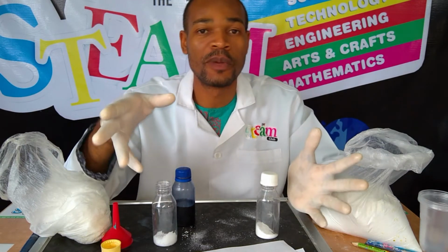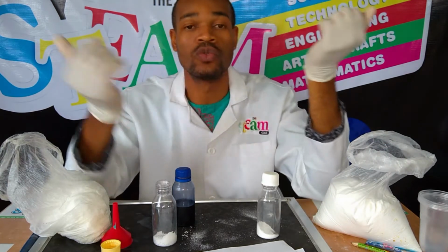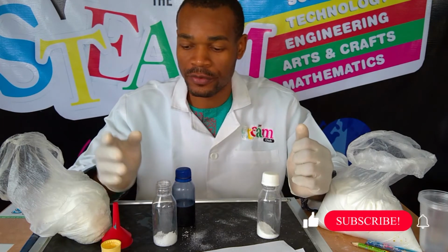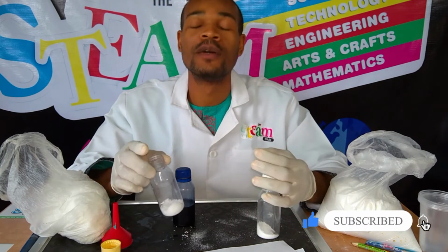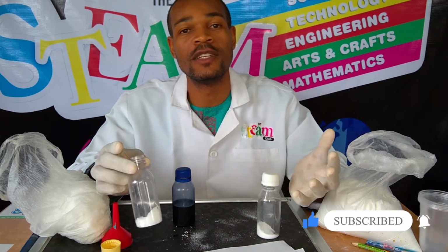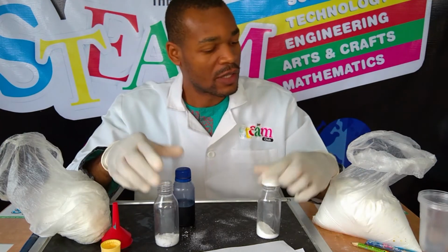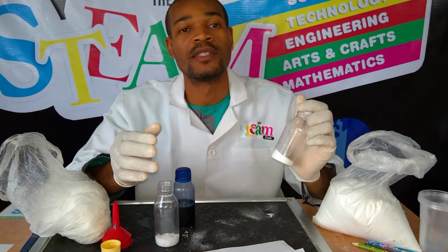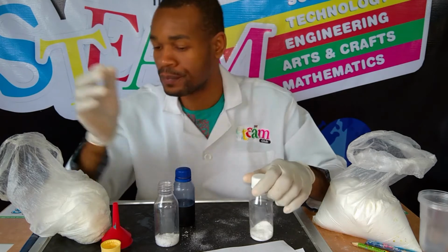Whenever you are performing the experiment at home, you have to use safety gloves like this, and take your overalls to protect yourself. But it won't kill you, okay? It doesn't kill. And it is used basically in the soap manufacturing industry, used to make soap. And glucose here, we all know what glucose is, a sweet substance that is an additive in most foods. So that's glucose for you.